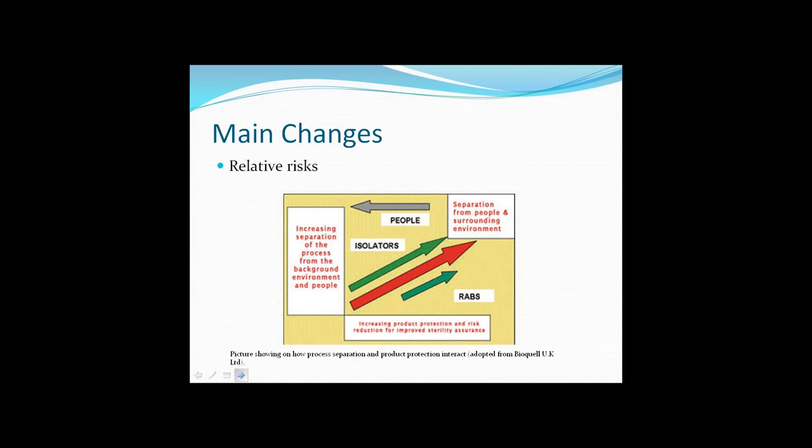And this is based on the degree of personnel interaction, based on the premise that people are the biggest risk to clean rooms. So the less that a person can interact with the aseptic core, the better this is and the less chance of contamination occurring. And we'll see later that these expectations are based on technological limitations rather than product risk itself.